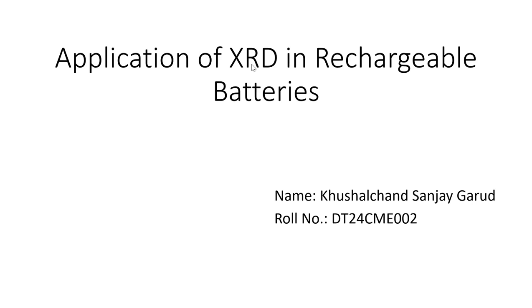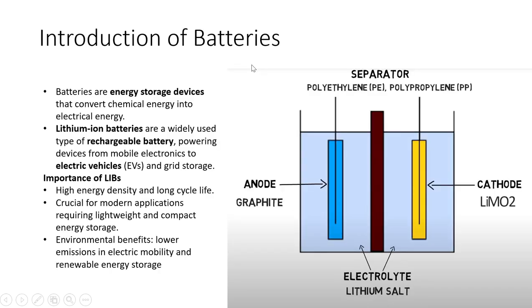Good morning. My topic name is application of XRD in rechargeable batteries. So let's see the introduction of batteries. Batteries are the energy storage devices that convert chemical energy into the electrical energy.